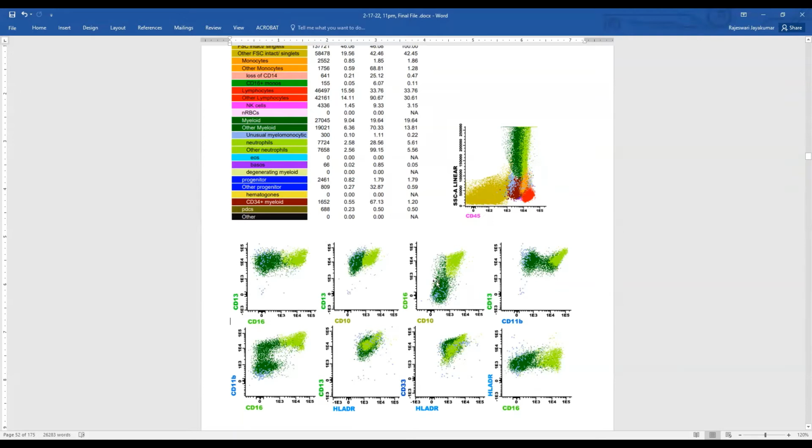So that is again the same thing that we saw here. CD11b is the brightest in neutrophils, so that is normal. We see that here. And then CD11b is usually negative in the promyelocyte stage. That is also normal. CD11b is slowly acquired in the myelocyte and metamyelocyte stage.